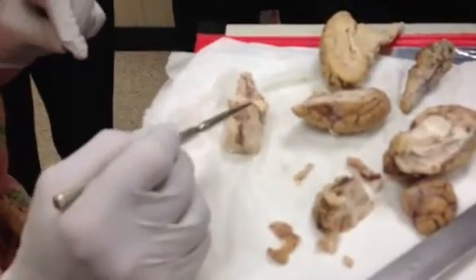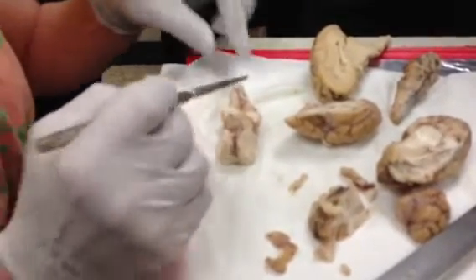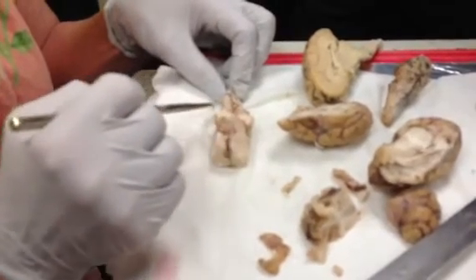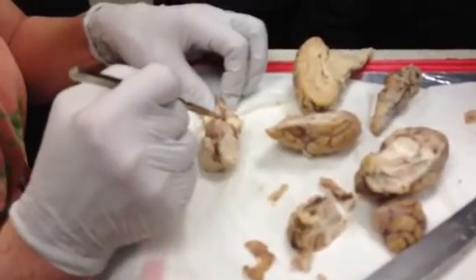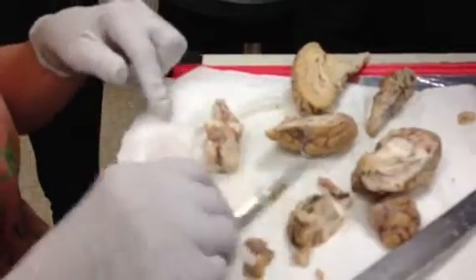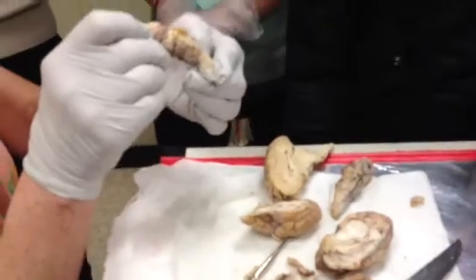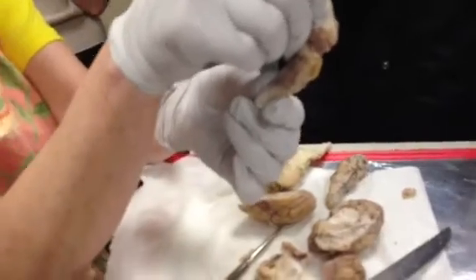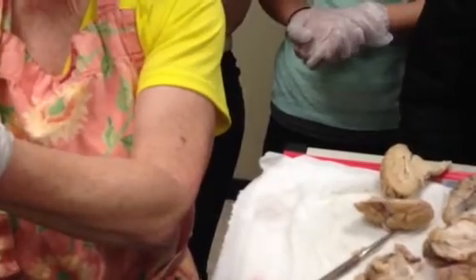That produces your circadian rhythm, sleep-wake cycles. Superior colliculus, inferior colliculus. Cerebellar peduncles, fourth ventricle, and the central canal is going to feed the spinal cord. So if you handle it, you'll be able to see the central canal. Can you see that hole? That goes to the spinal cord?